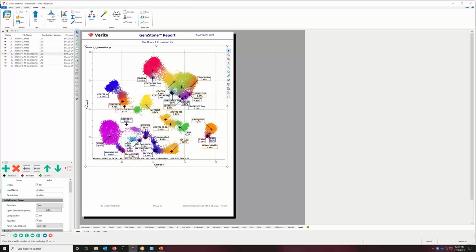We have B cells here. There's gamma delta T cells, NK cells. We have basophil-like cells. That was my terminology. And then we have monos, we have classical, intermediate, and non-classical monos. So all of the cell types are represented. There are various things that you can do. I told you that this graph is interactive. We can actually zoom in on a population.